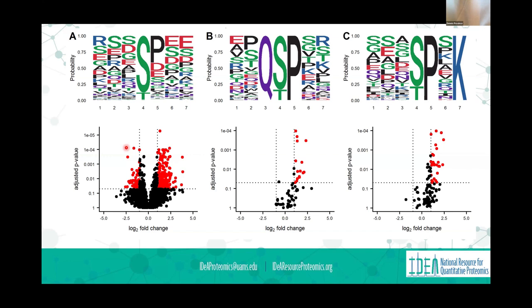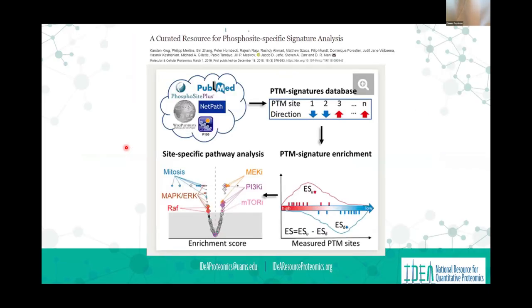Usually they say, I don't know what to do next before they get too far, because if you've got 10,000 phosphorylation sites, the first thing you're going to do is look at the one site that you're really interested in. If you're really interested in that one site, probably better to contact Mike and do a targeted experiment looking for that one phosphopeptide, right? But it does allow you to generate a lot more information.